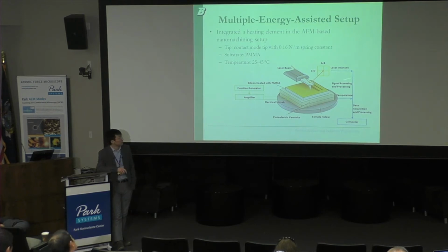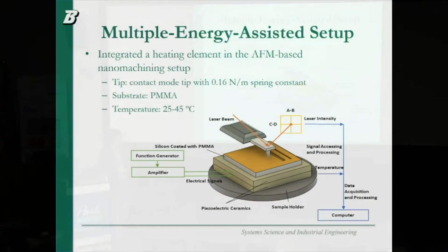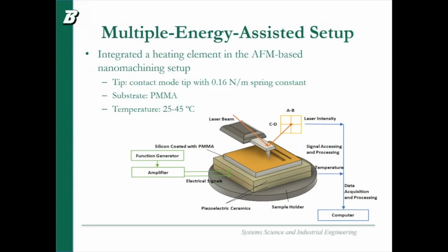So because we already have the XY vibration, I'm trying to make it larger so we can see it clearly. We have a Joule heating thermal element between the sample and the XY vibration. Because we have Joule heating, the temperature can go up from 25. It can actually go up to more than 100 degrees C, but I don't want to destroy the AFM.